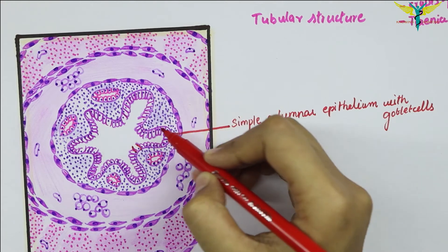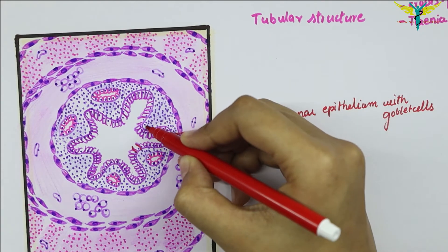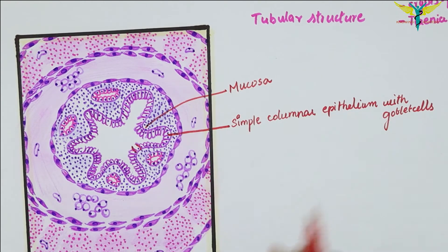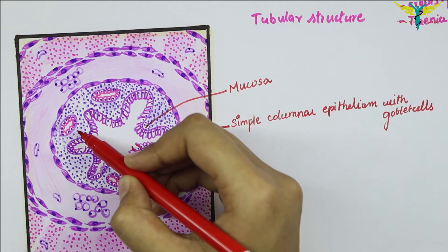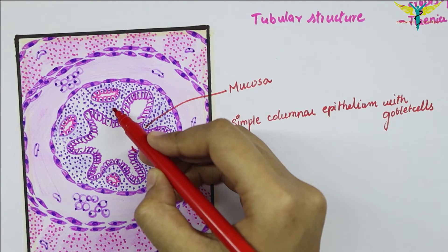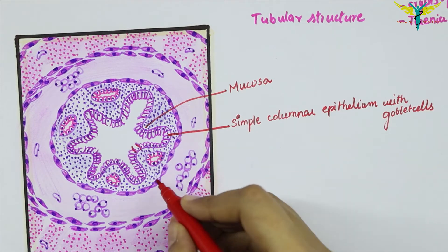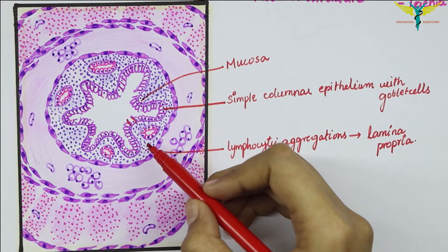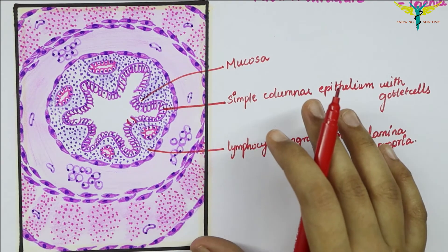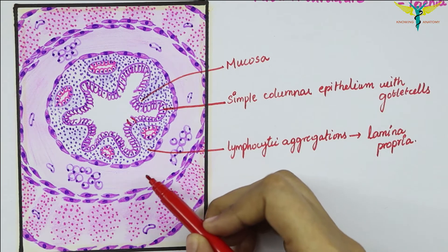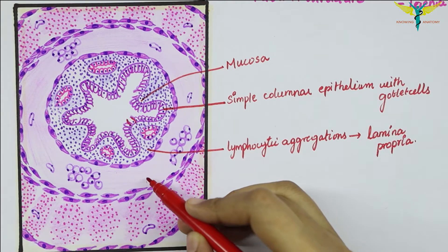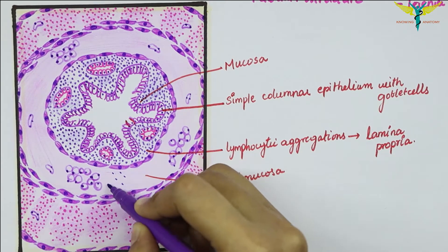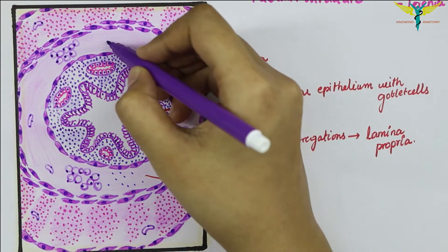The crypts in the vermiform appendix are poorly formed. You can see the presence of scattered lymphocytes and aggregated nodules of lymphocytes in the lamina propria of the mucosa — these are the lymphocytic aggregations present in the lamina propria. These lymphocytic aggregations continue into the next layer, the submucosa, which also shows a variable number of lymphatic nodules extending from the mucosa.